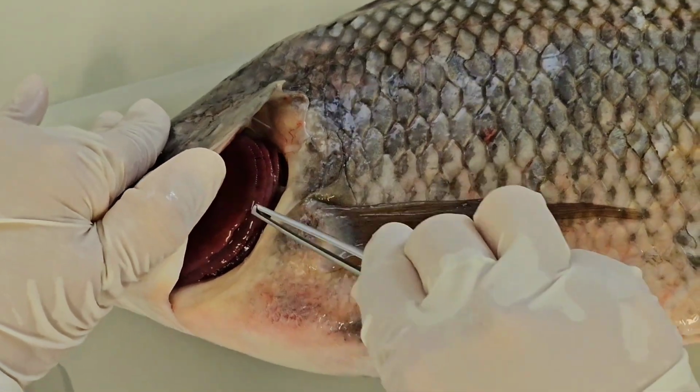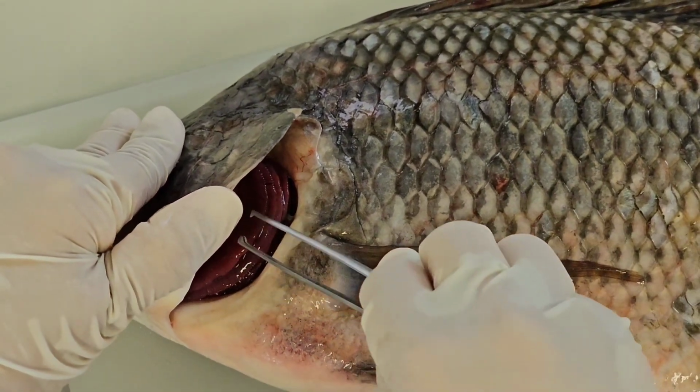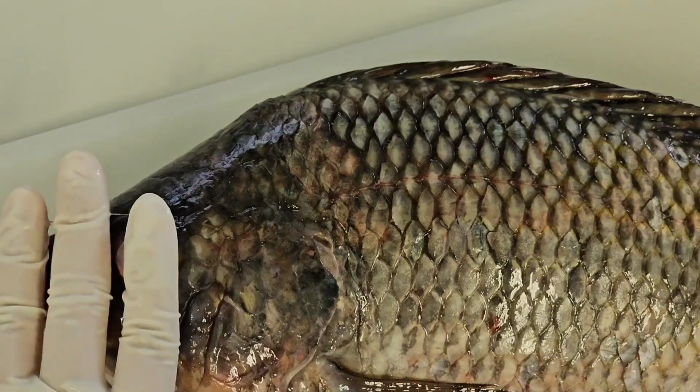The gill is used for gas exchange. You can see the red color because it has blood inside. And the gill is composed of the gill filaments.